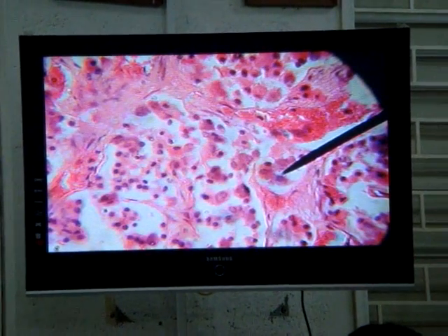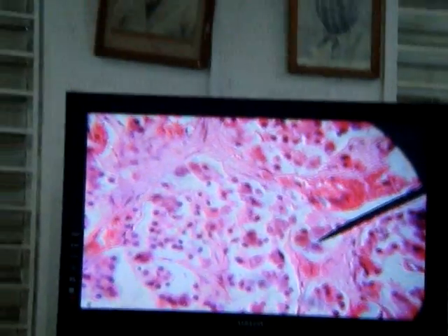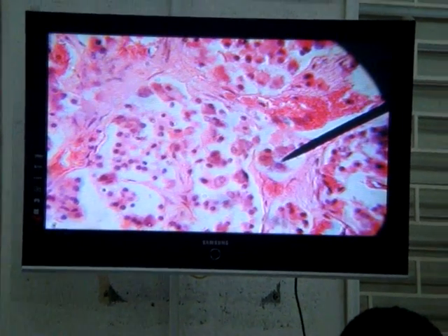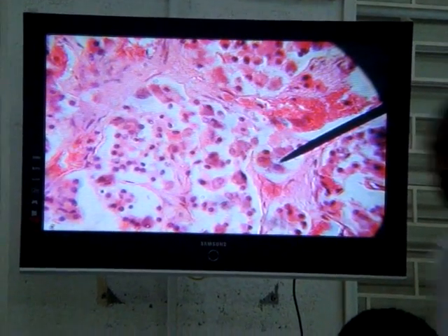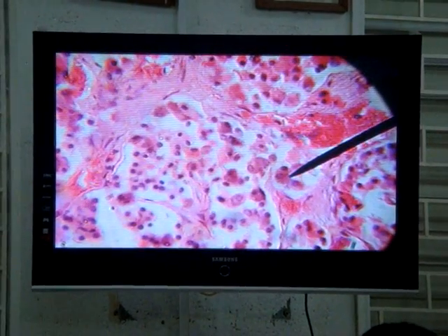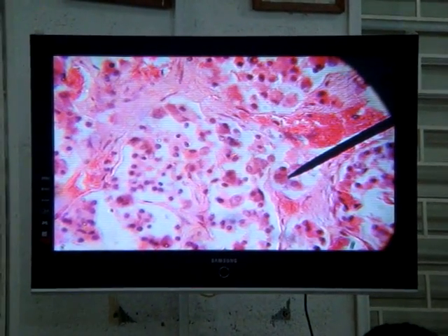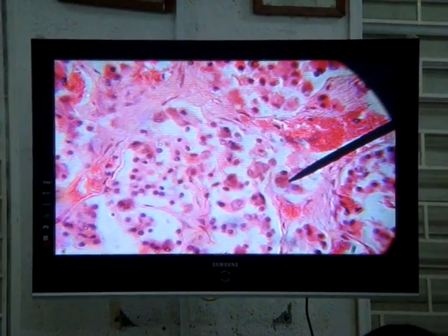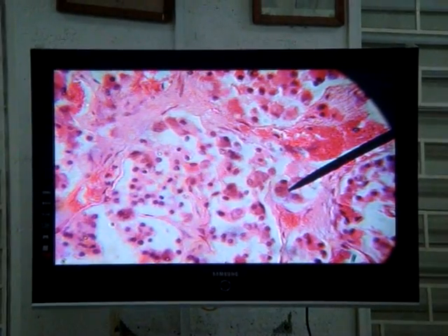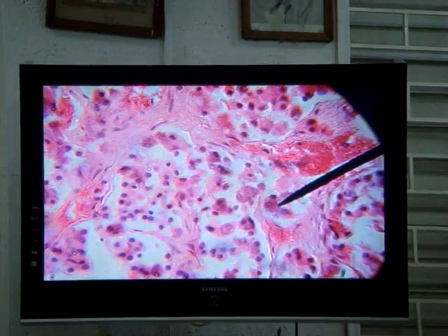So you have to be observant. That's one of the key things about this faculty. You have to be observant, or else you're going to kill your patients. So that's a basophil. Now just next door, this one here, what's that? That's the acidophil, and you see that the cytoplasm is just a little bit brighter. Good. So you can identify and differentiate these two cells with the H and E. Acidophils: brighter cytoplasm. Basophils: cytoplasm slightly darker.